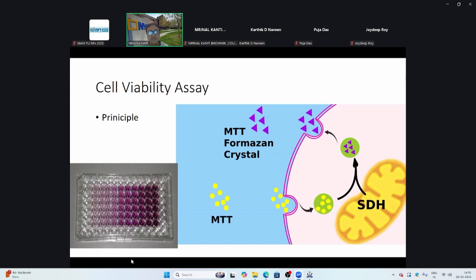Well, that's simply because a cell-based assay takes the intact cells from the tissue culture or from, let's say, the blood, and it uses those same cells to examine the performance, to examine any activity that the cell would do while it is still living and viable.